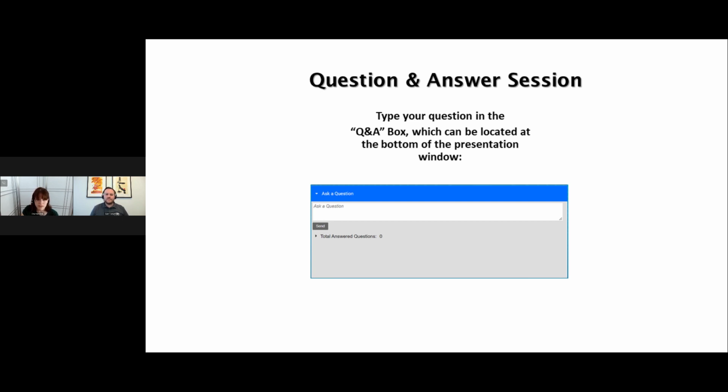Thank you. And this next question coming in is from someone using an Orbitrap system for their research. The question is, how does TIMS TOF compare to Orbitrap in terms of PFAS separation? Sure. So Orbitrap is going to usually have a little bit higher resolution. So from a mass resolution perspective, that will be a little bit different. However, there's no ion mobility stage on an Orbitrap.